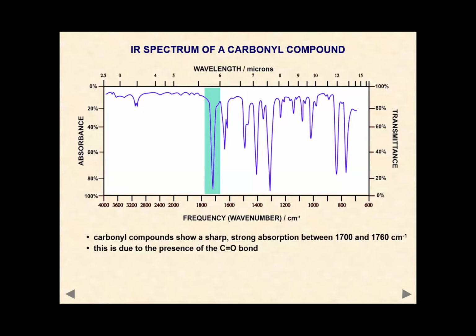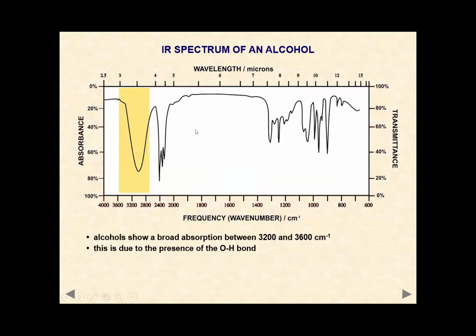All right. Now the next slide, which I was showing you. Just check the x-axis. If you get a peak between 3200 and 3600, this range, the yellow part, then this is a particular absorption peak for the OH group.